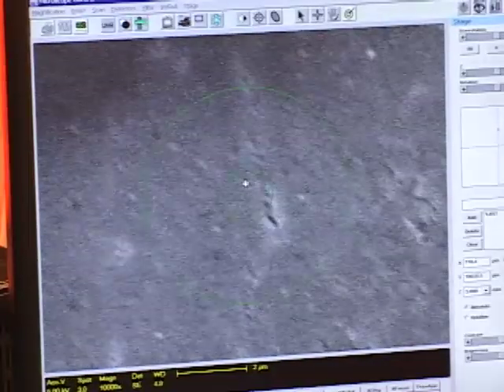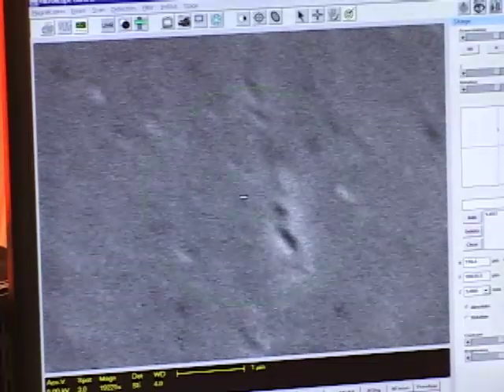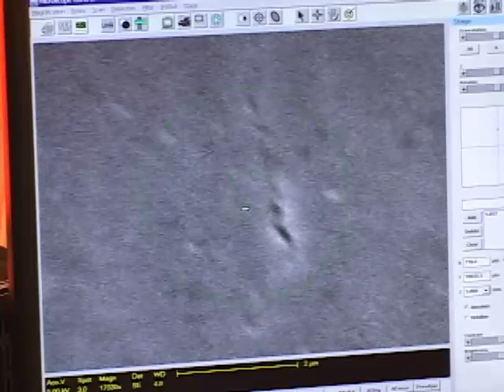Another stage movement tool we use a lot is the donut tool, technically called the tracking mode. If I activate tracking mode, you see it brings up this donut on the screen. At the center of the donut hole my icon changes — in the top half of the donut hole I have a plus for fine zoom in when I left click, and in the bottom half I have a fine zoom out.